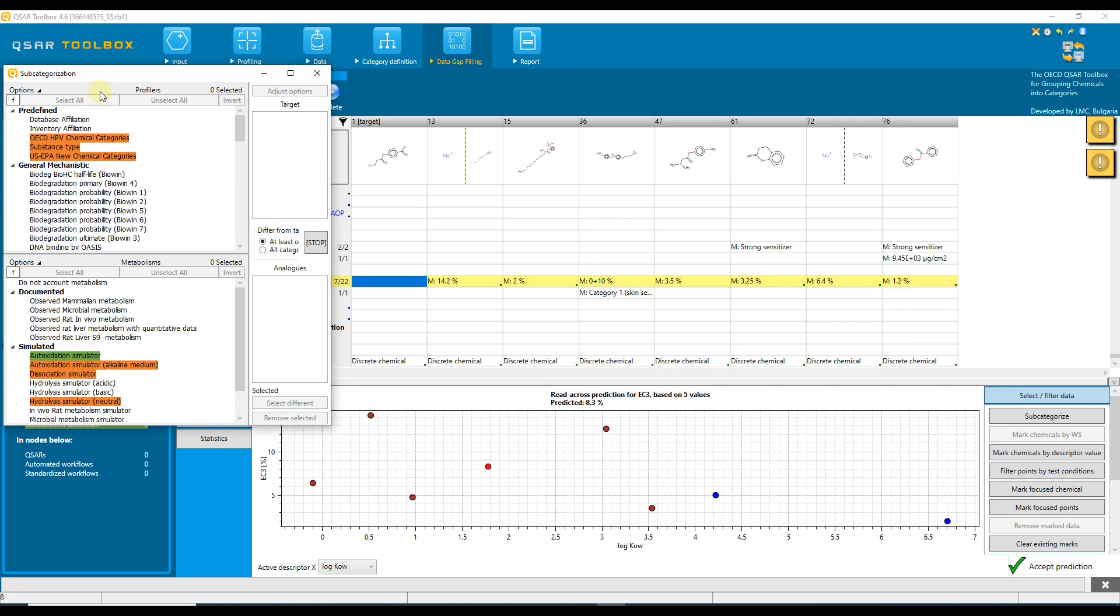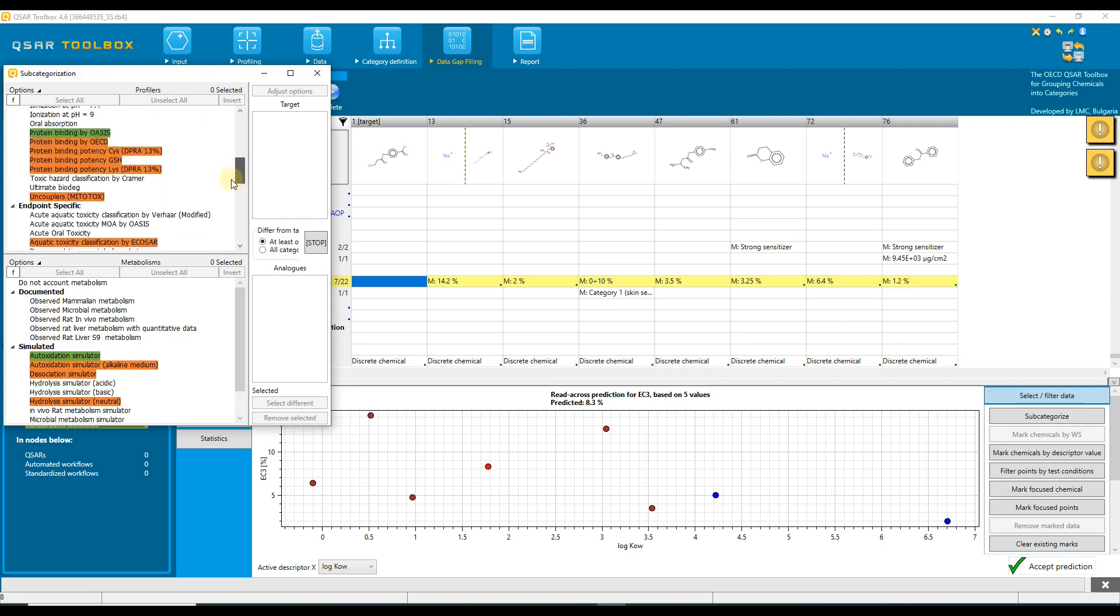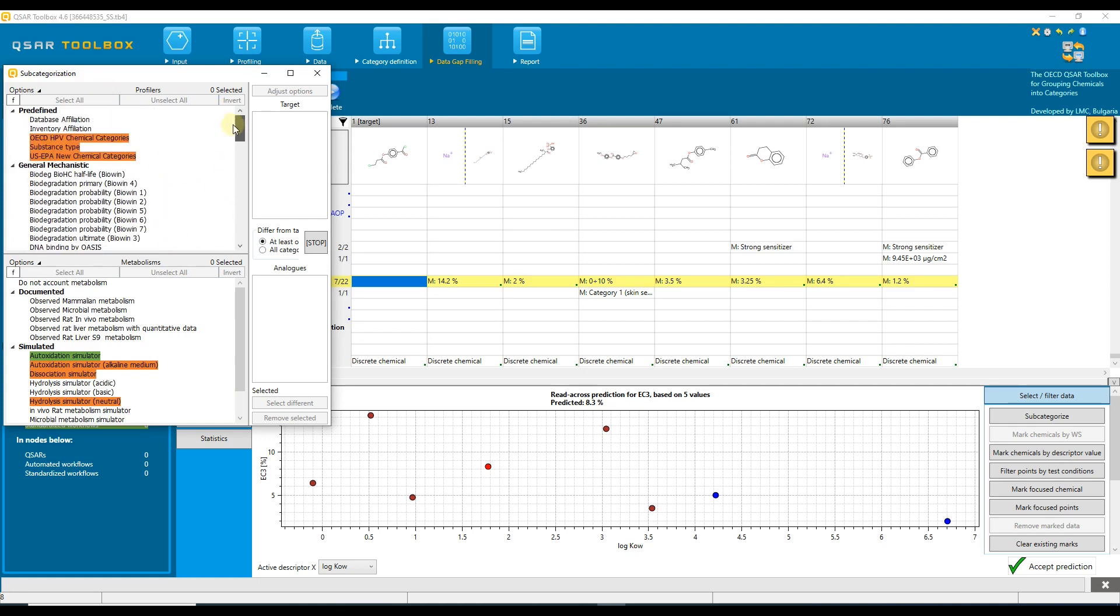Here we can see the same profiling schemes that were presented in the profiling section and that are also available in the category definition section for building the primary category. On the other side of the dialog are additional fields, which are going to be explained in seconds.